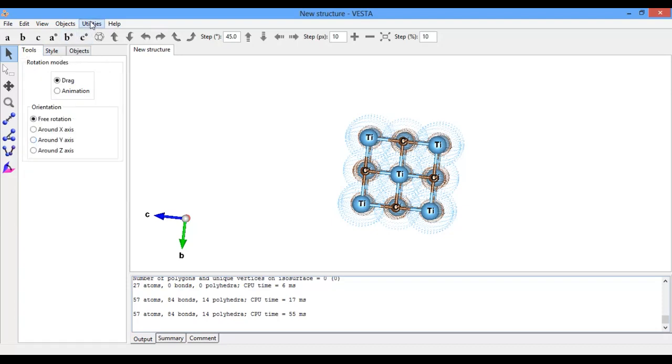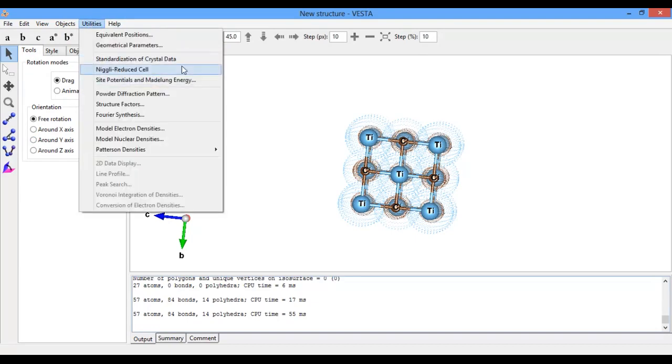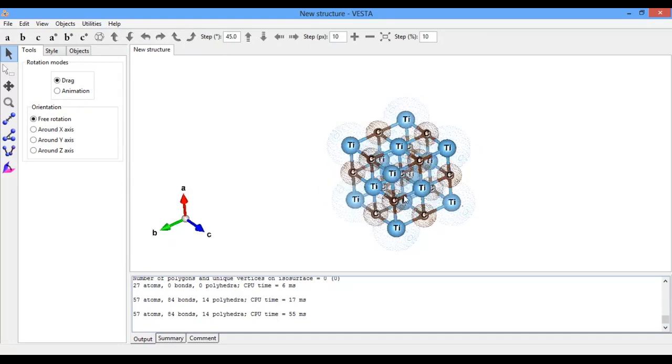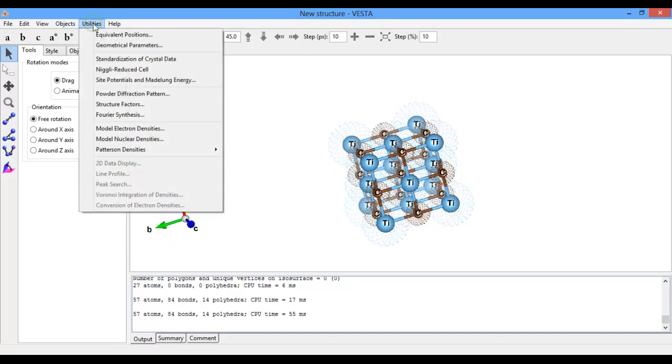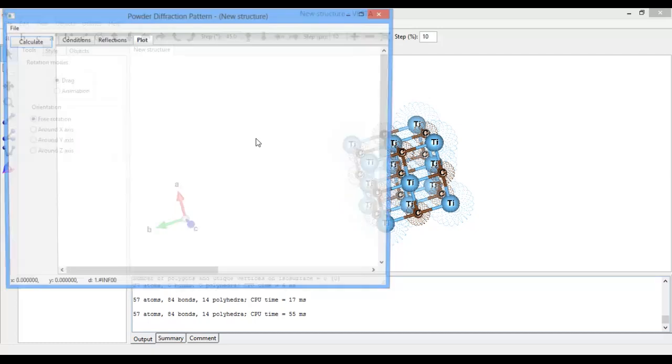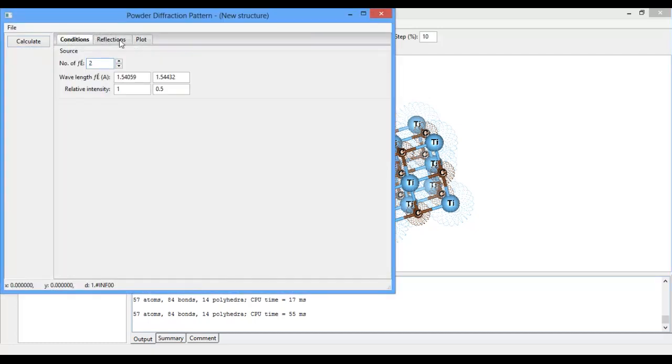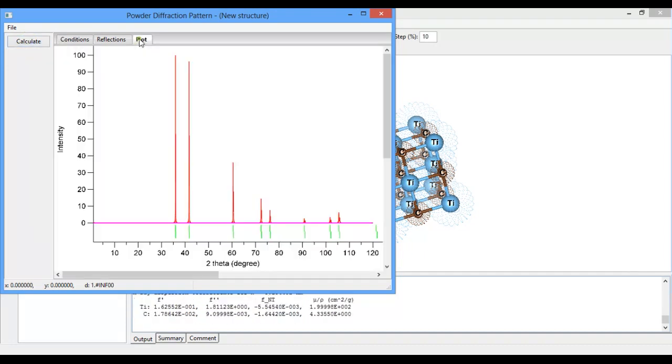If you want to see the powder diffraction pattern of this material, just go to Utility and click on Powder Diffraction Pattern. These are the conditions. I will use CuKα 1.540. Click on Calculate.